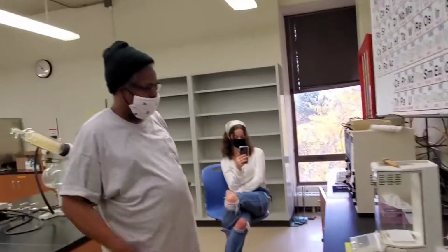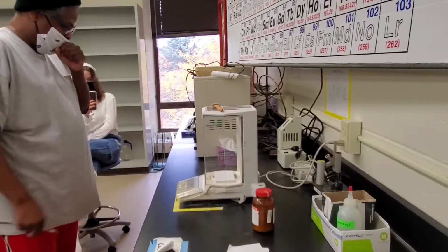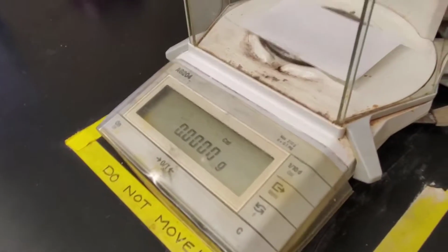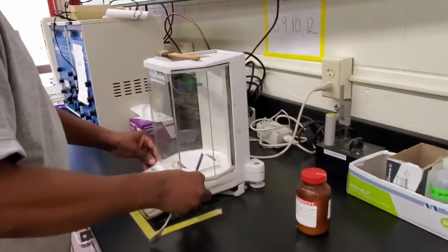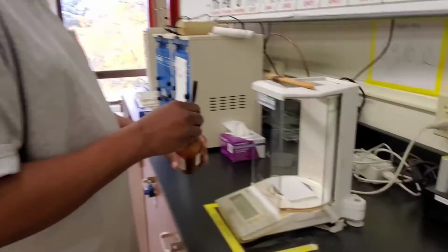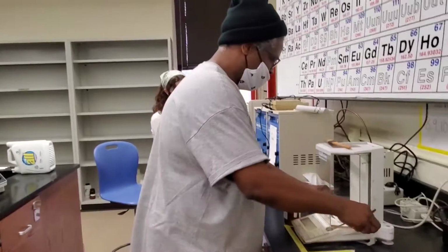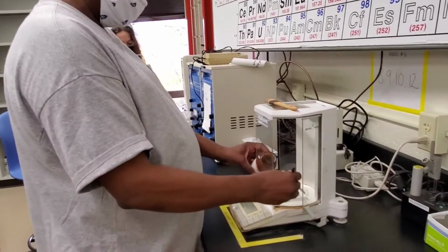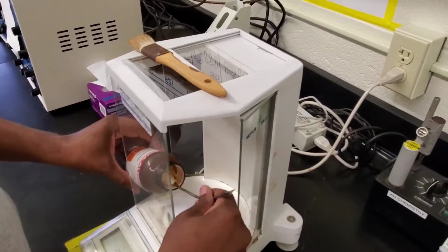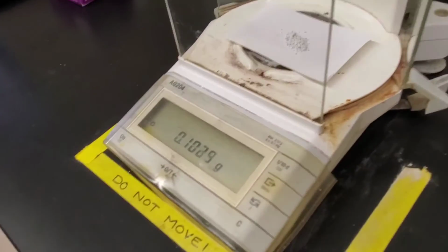All right, I know everybody thinks they know how to do this, which you probably do, but you put your weighing paper in, you tare it, so now it's 0. Okay? And what I would suggest doing is, instead of doing something like this, right, and then putting it all the way through here, what I would suggest doing is to actually have this as close as possible, even inside, okay? And that would minimize spills and all of that. And so something like that is what I would prefer you do.